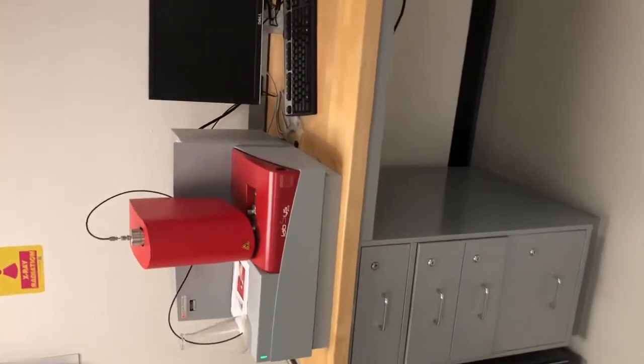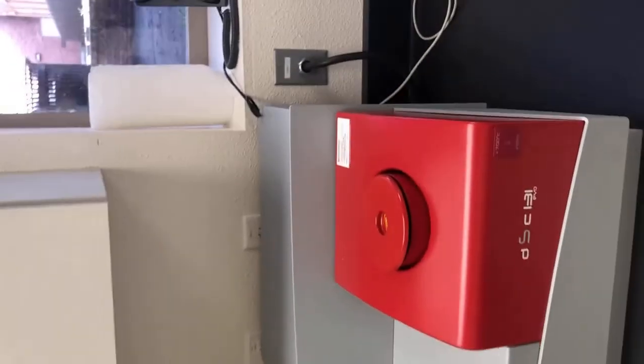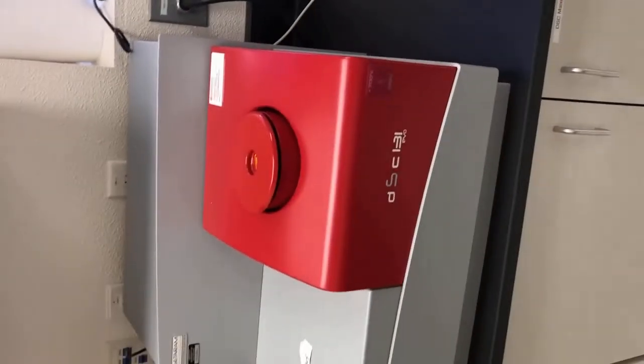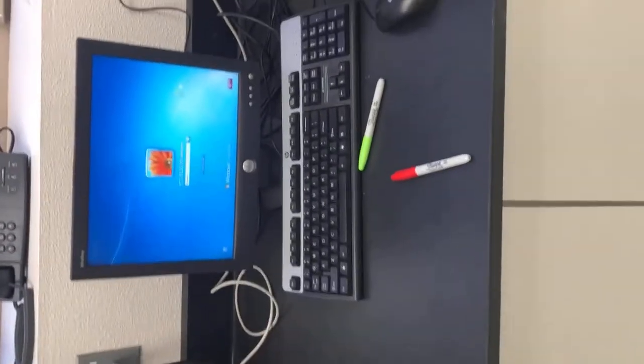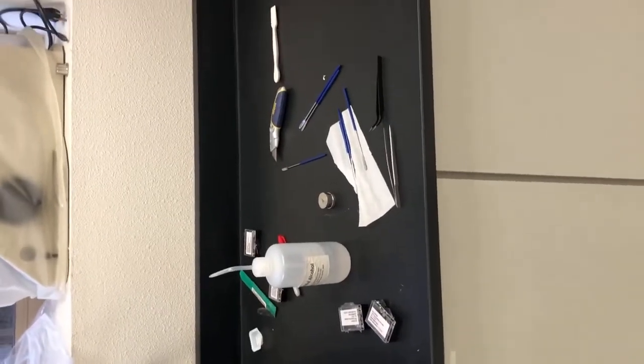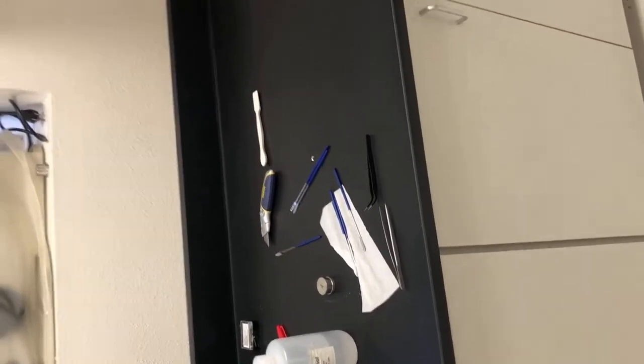This is a very fancy DSC machine — we won't be using this one, but we will extensively be using this DSC machine. Differential scanning calorimetry will be used for our DSC lab, and more importantly, you'll analyze that data for your poster session, which is going to be very fun. Students really tend to like it, and it'll be interesting to see how we do it virtually this year.